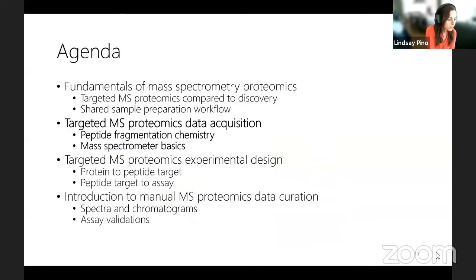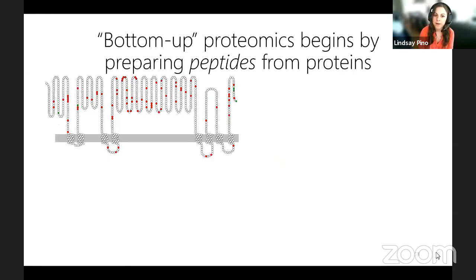So I'm going to pause real quick and see if there are any questions so far, comparing the sample preparation workflow that's shared between discovery and targeted. And it looks like we're doing okay for now. So I'm going to move on to the next part of the lecture.